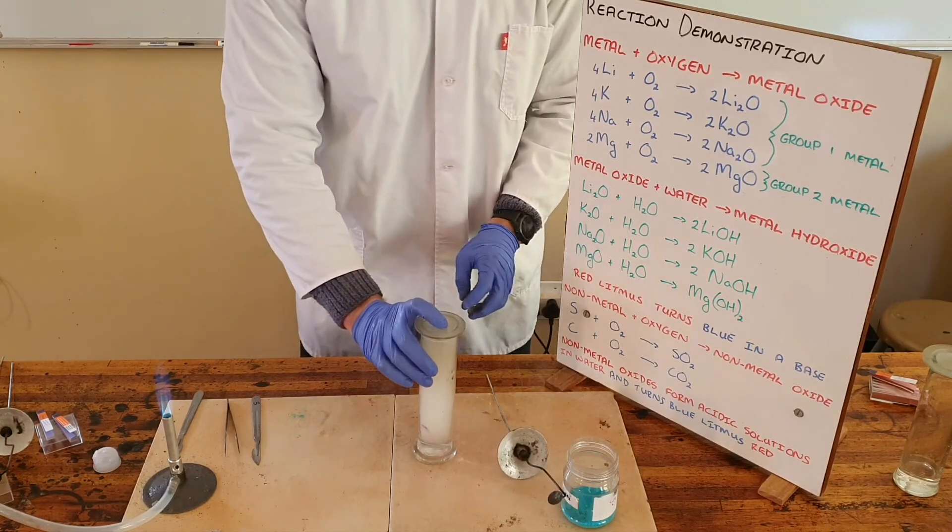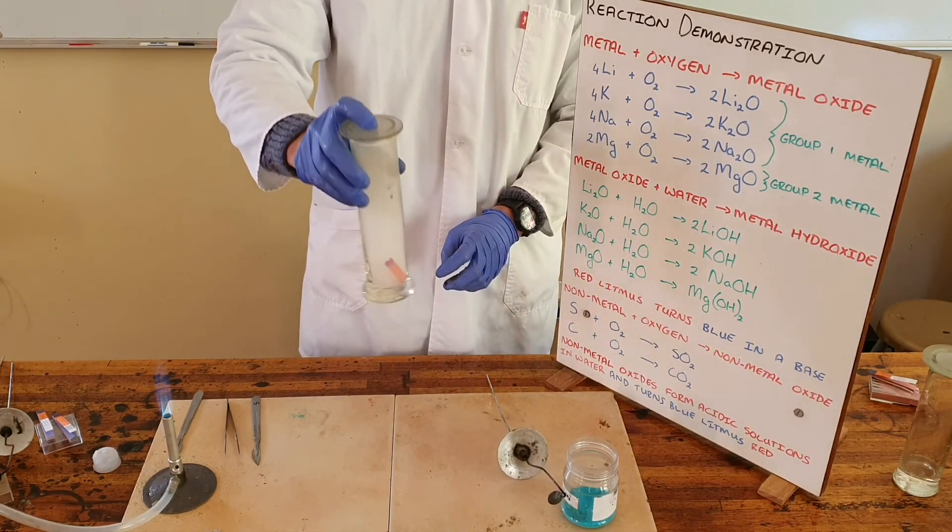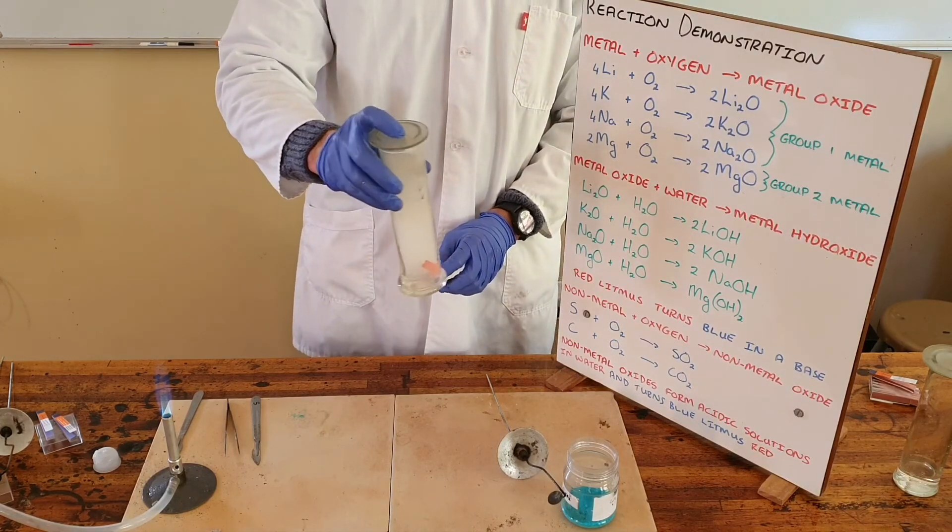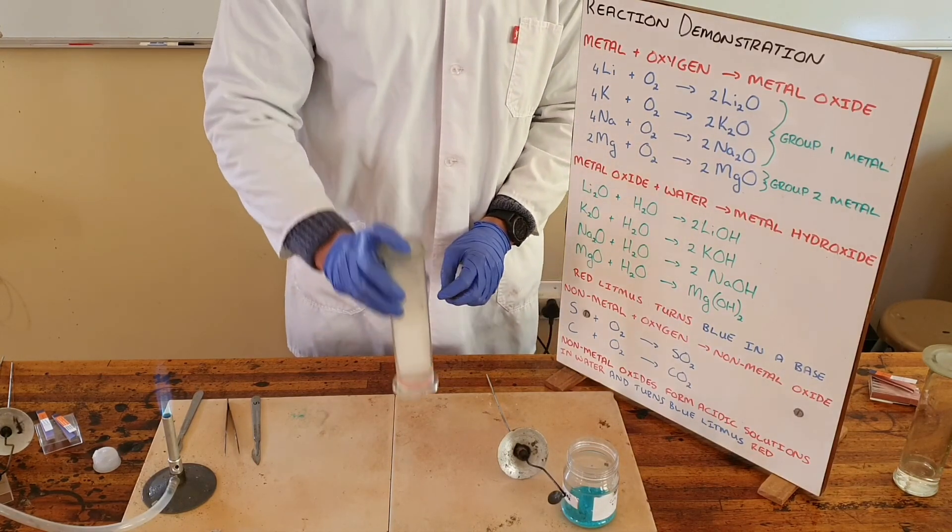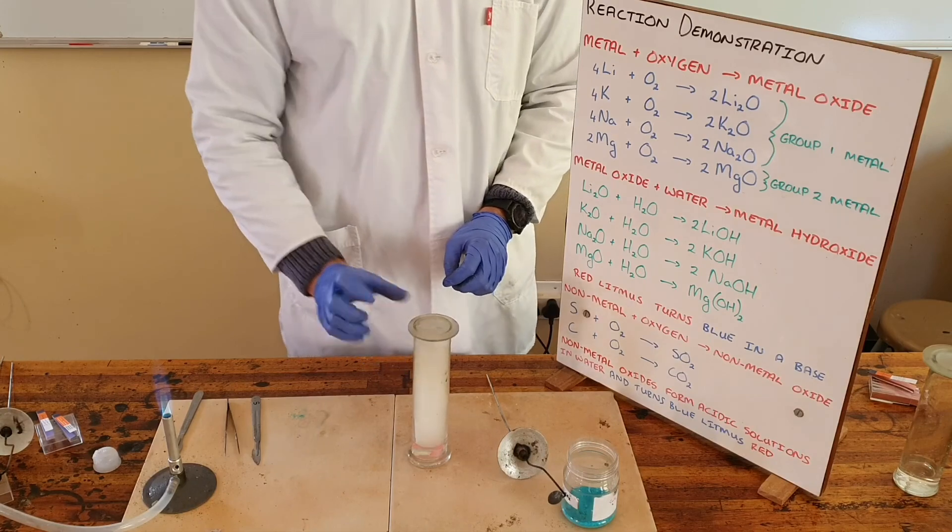So we can see immediately the blue litmus turns red which tells us that the solution that is formed here is an acidic solution.